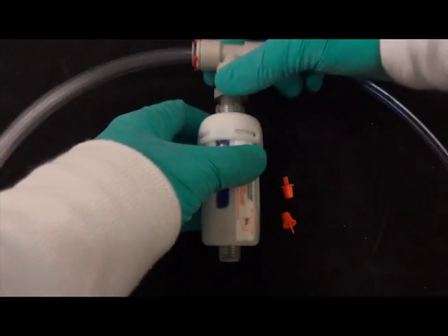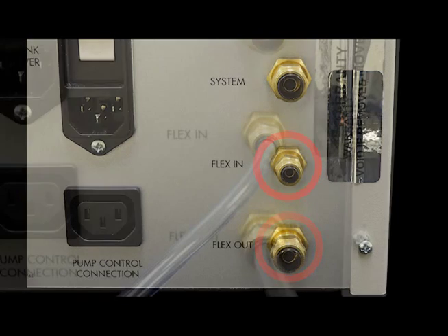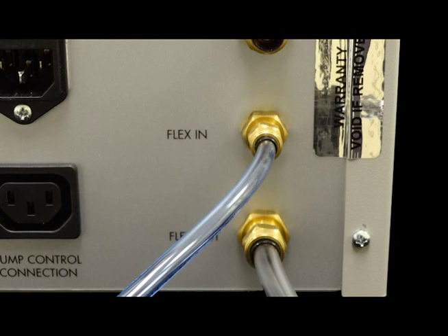The tubing attached to the supplied adapter connects to the FlexIn and FlexOut ports on the back of the FlexLink. If necessary, first remove the FlexIn and FlexOut tubing from the back of the FlexLink.